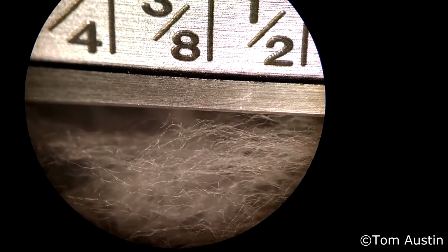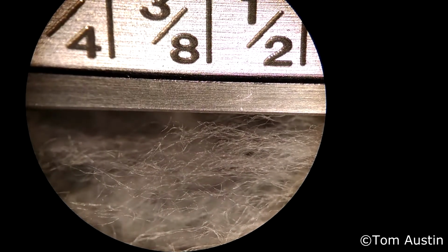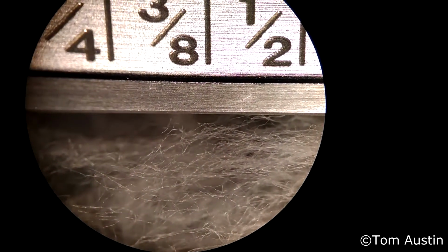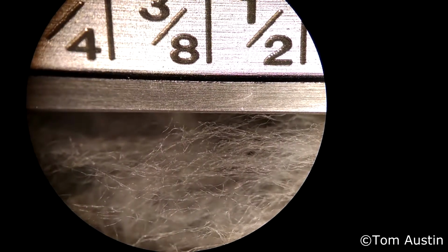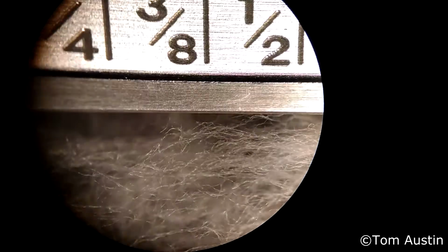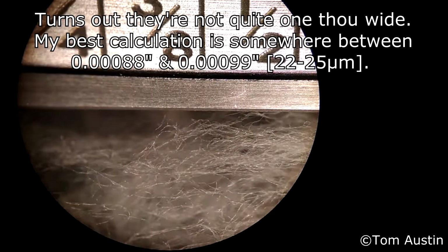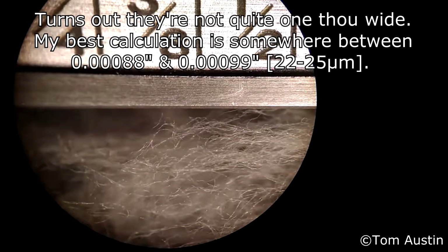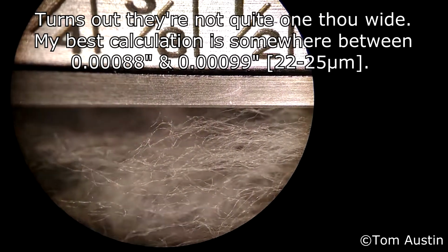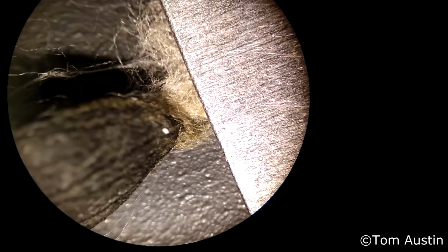Just to get you an idea of the scale we're working at, each one of those marks up there is 1/8 of an inch. So I put the caliper on 1/64 and put it down there, and these are absolutely minuscule fibers. So we're talking a thou at best. You know, finer than a human hair. These are very, very fine fibers, which is what gives them their extra fine thread quality and super high tensile strength per weight.